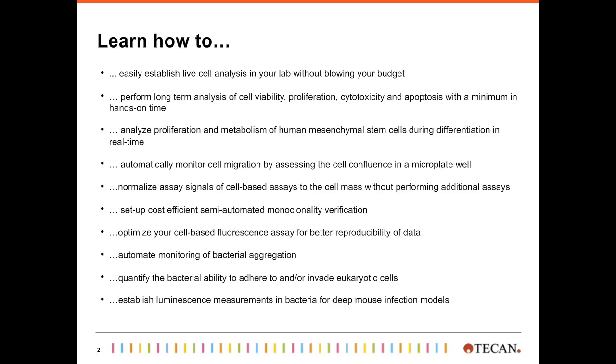This will include how to automate long-term cell viability, cytotoxicity and apoptosis assessments. I will talk about how to automatically monitor cell migration and how to perform monoclonality verification with the system's integrated imaging module. I will explain how to normalize signals from cells to the cell mass per well using confluence assessment. And I will talk about the importance of whole well analysis in fluorescence bottom readout.